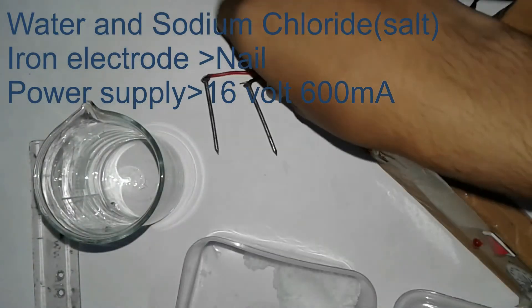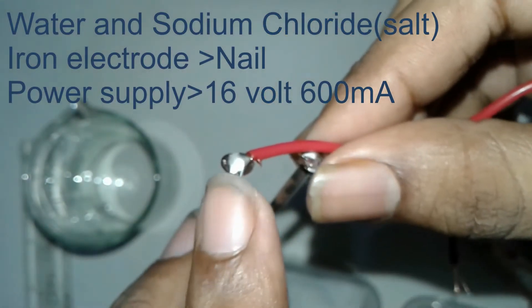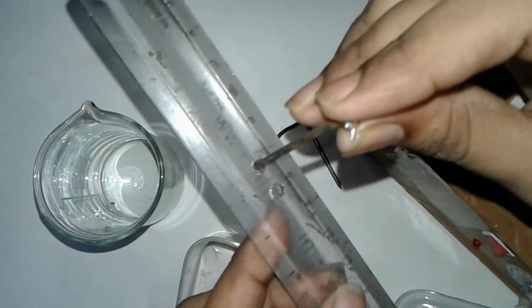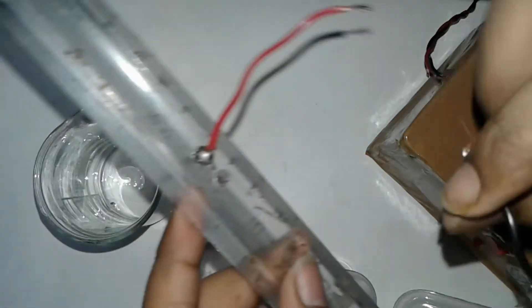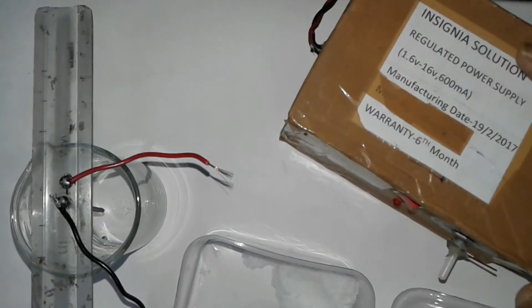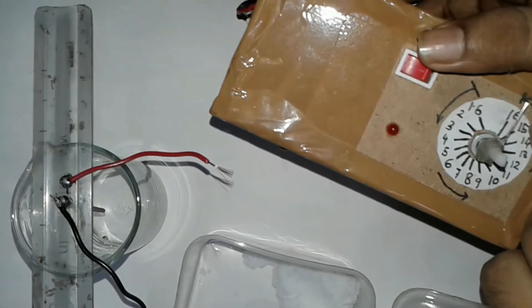With respect to iron, you can see here I soldered the electrode with wire for proper seating of the electrode. I take a scale and make two holes where I feed those electrodes. Now this will fit here. For the power, I use a DC power supply at maximum 16 volts and 600 milliamps, and I do the electrolysis at 16 volts.